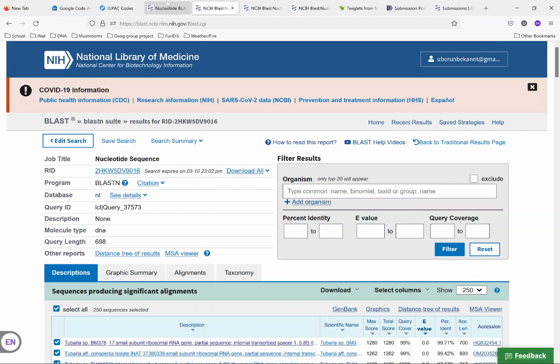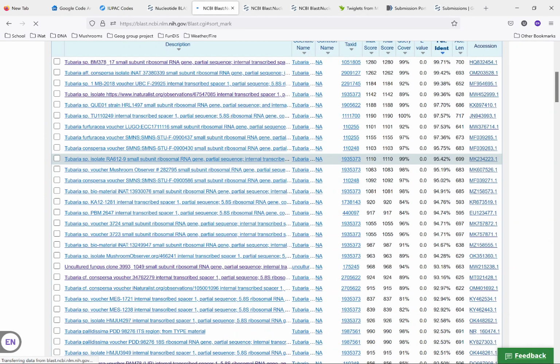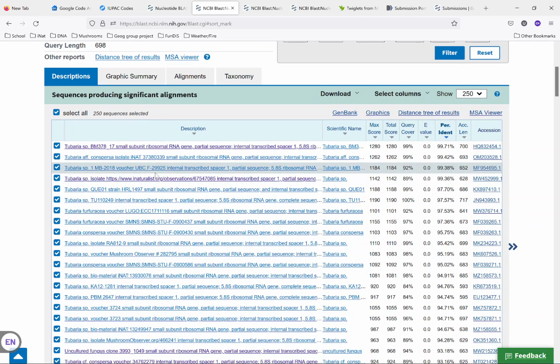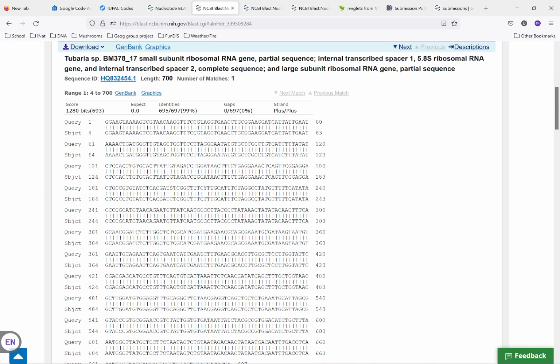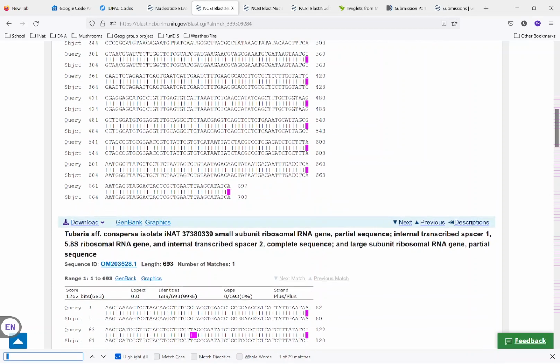Let's see if we did better. Yeah, it was much quicker to just copy and paste. So I didn't enter the ambiguities before I went and blasted it. I'm going to have to go back and fix that because you can see they're not in here.